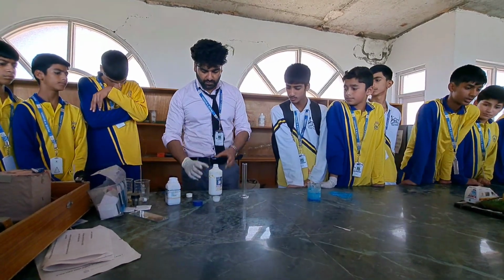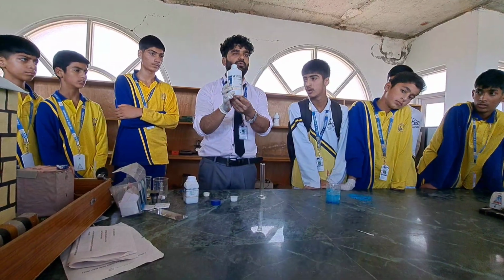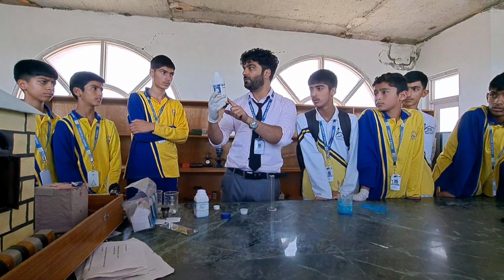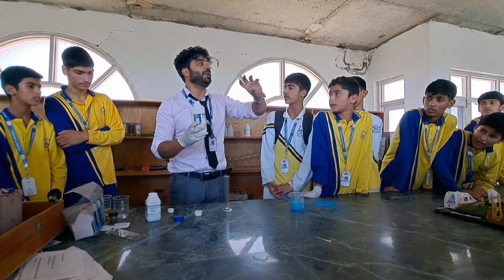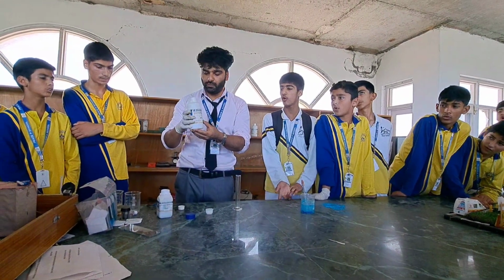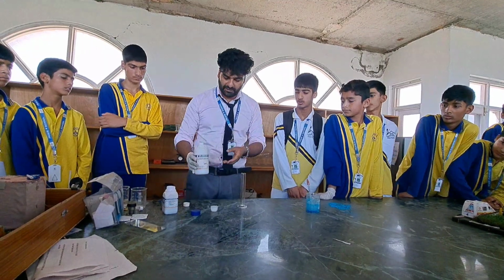Okay. Look, students, I have taken, this is in my right hand, a bottle, and this is the sulfuric acid. Do you know which kind of sulfuric acid it is? It is dilute sulfuric acid. Can you tell me what are dilute acids? Yes, sir. Which contain water. Okay. What is the formula of sulfuric acid? H2SO4. So this is the sulfuric acid in my right hand in this bottle.